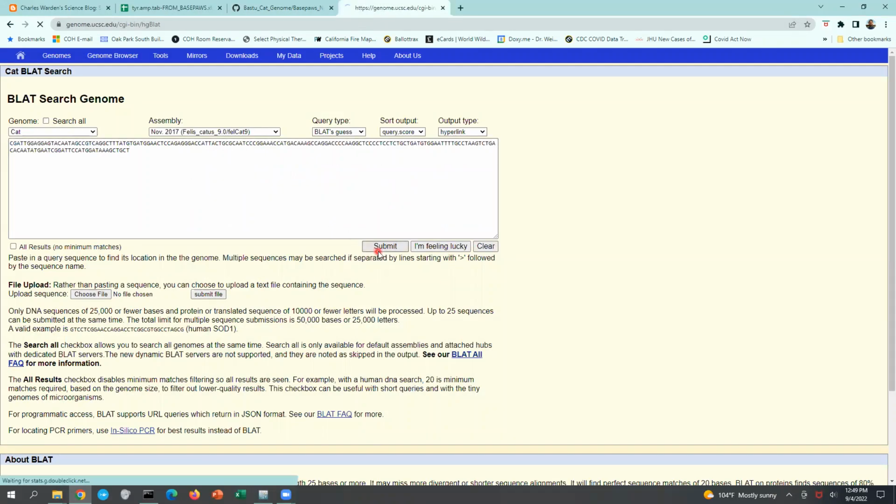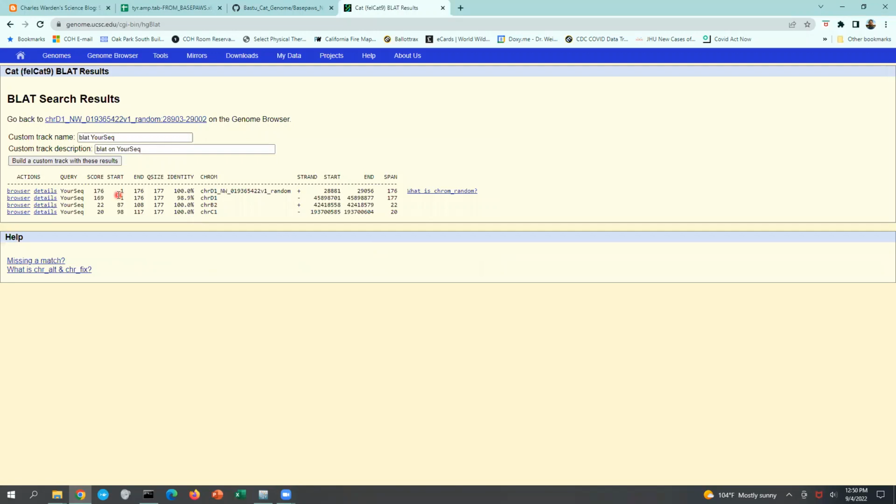So we're going to click submit, and it's good. It says that position 1 to 176, which is what matches her whole genome sequencing data, is 100% matched to the genome build. That last nucleotide is different, but that last nucleotide is not different in your whole genome sequencing data, so we're not going to focus much on that. So at this point, because it's 100% identical, and we know the reference build is the wild type sequence, then you know she has 0 copies.